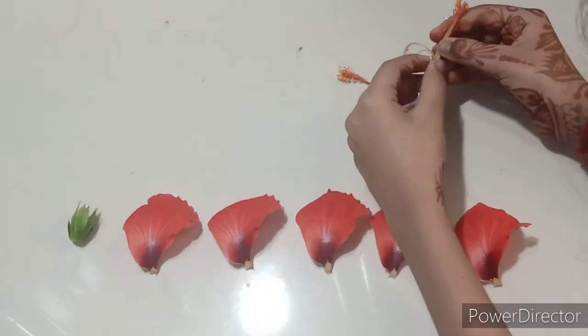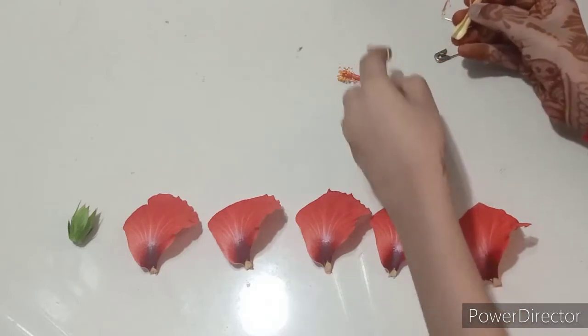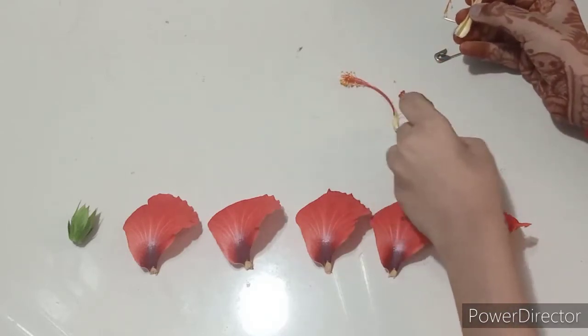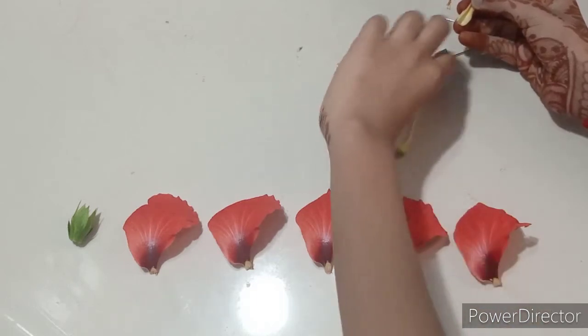Now I'm going to divide it, and as you can see here, I have obtained the stigma, style, and ovary. I have also obtained the filament and anther, as you can see.